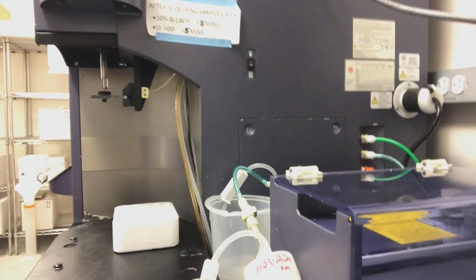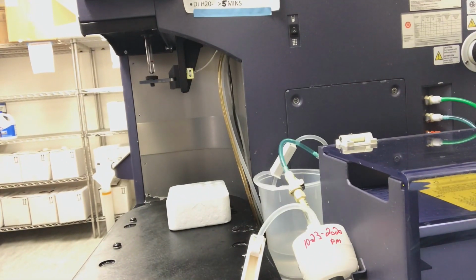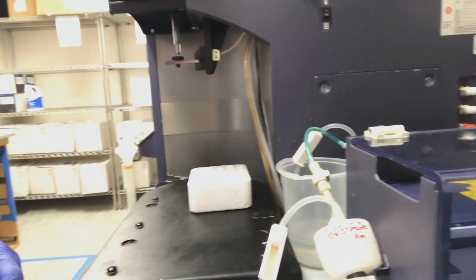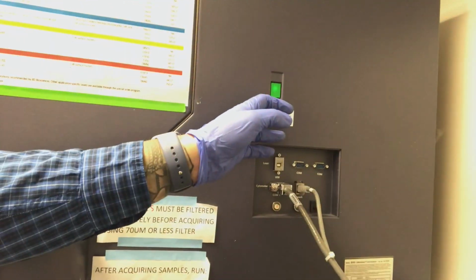Once you've exported your data, and the machine is in standby after having run bleach and water, now you can decide whether you're going to power off the system using the green button here, or leave it on for the next user.